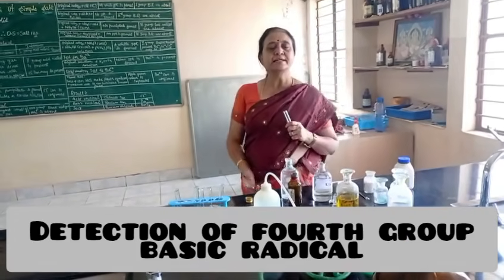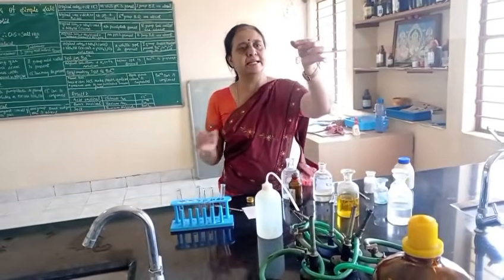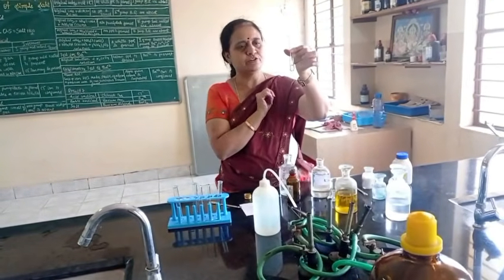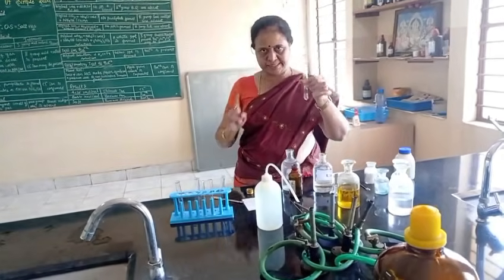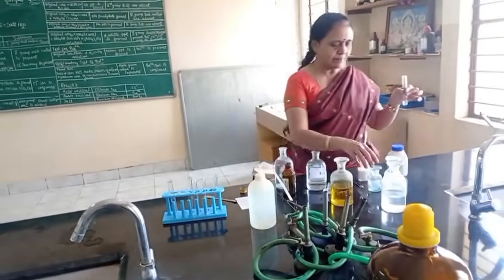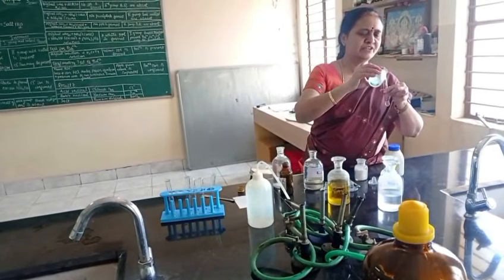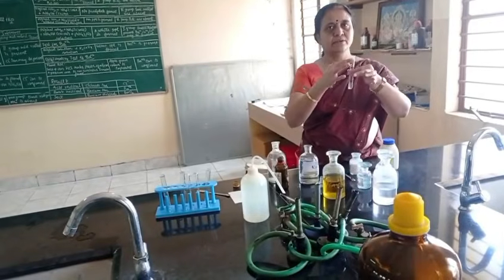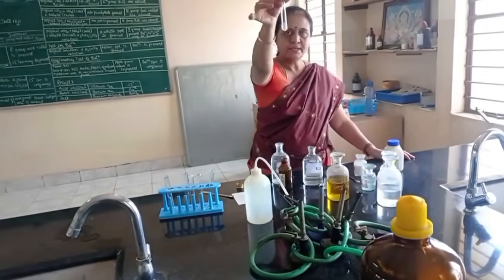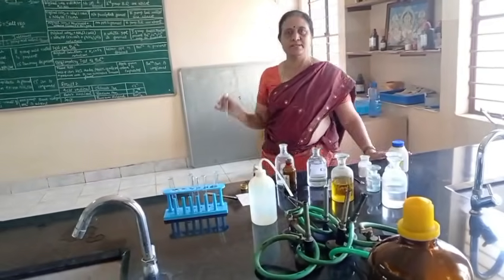Then I move to detection of fourth group basic radical. For fourth group basic radical, I take original solution. I am adding solid NH4Cl, then NH4OH excess. So for this, I am adding H2S. See here, I am not getting any precipitate. So fourth group basic radical absent.